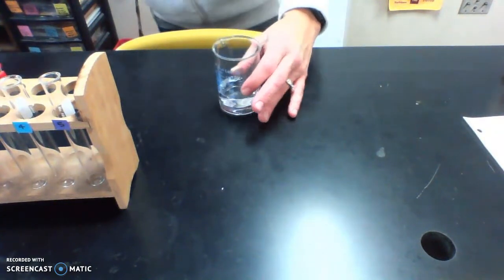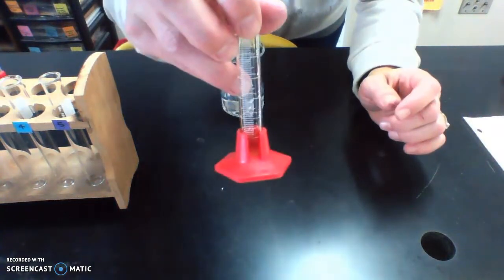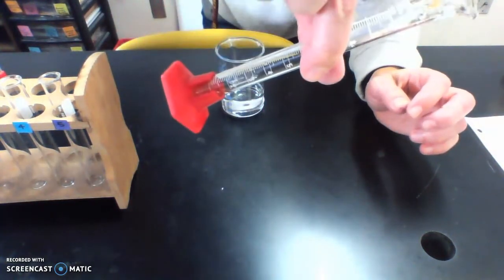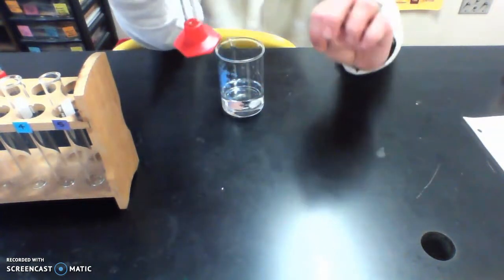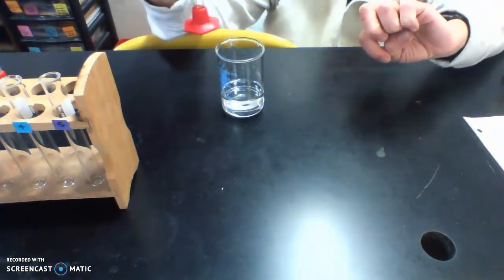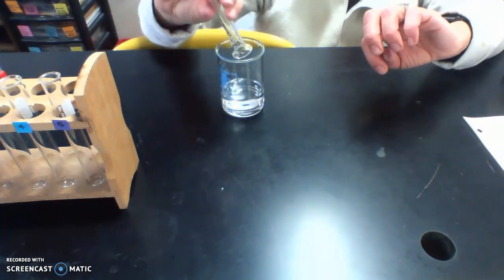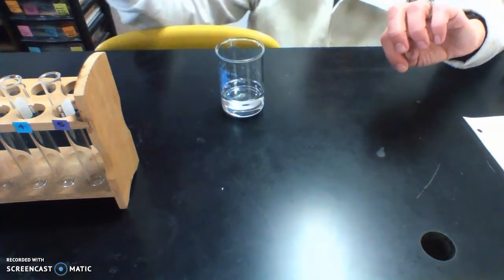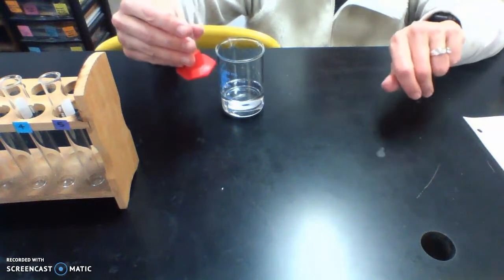And then I'm gonna add two different substances. So this first one, I don't know if you can see, is a clear colorless substance, if you can see it better. And this one is the potassium thiocyanate, KSCN. So I'm gonna add that to the water. There's no change. And then I'm going to also add 1 milliliter of iron(III) chloride.